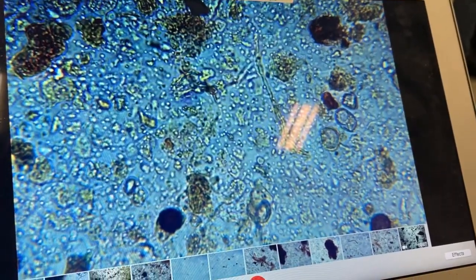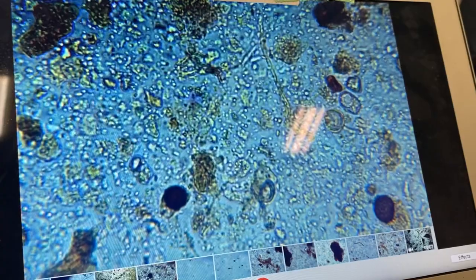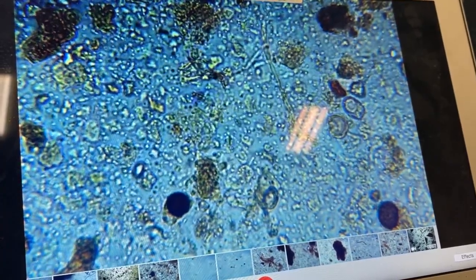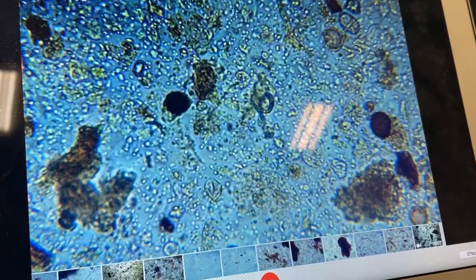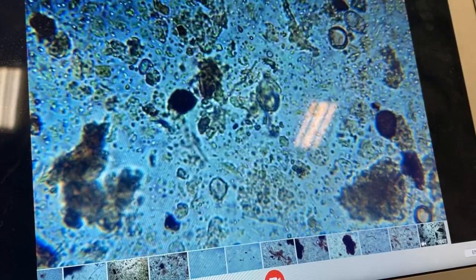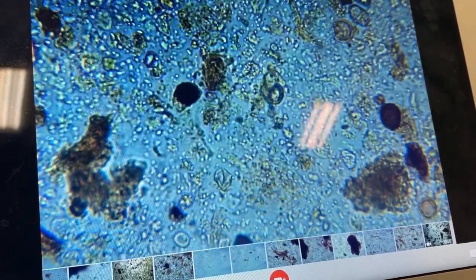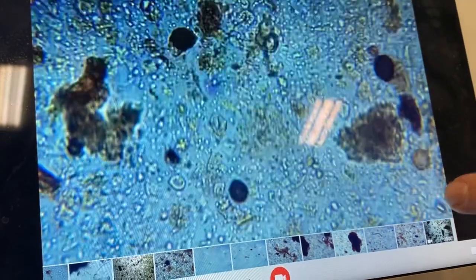More bacteria — look at the density compared to the last sample. You've got fungal hypha right there, lots of testate amoeba — one, two, three. To me, if you were to ask which one to use, I'd say both, but I would definitely want to use this one up at the beginning of the first season. Fungal spore, fungal spore — that might even be a fungal spore right there too.